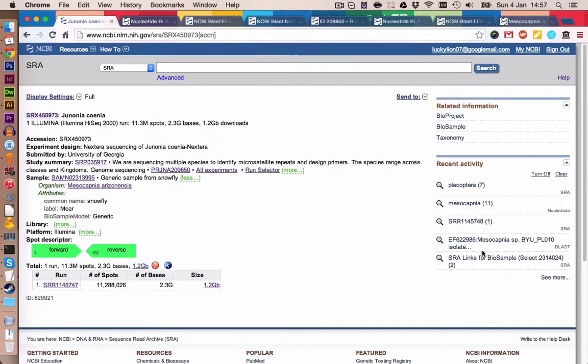Hello everyone. I promised I'd make a follow-up video to explain what went wrong with the last dataset. In the last video we had some problems assembling the mitochondrial genome. There was quite a lot of distance between the reference genomes and our reads. It turns out we actually downloaded the wrong reads.